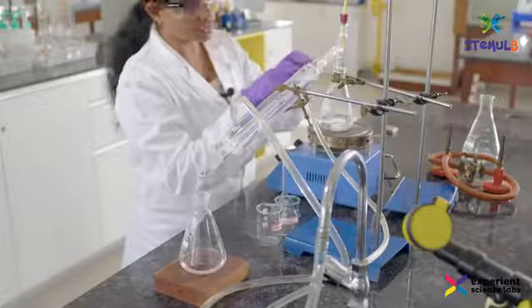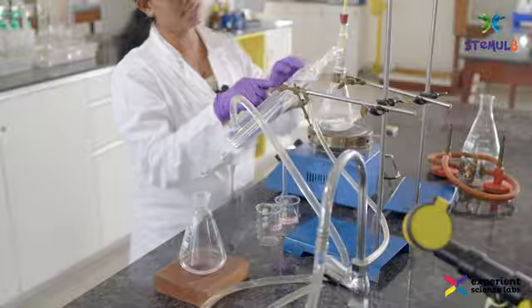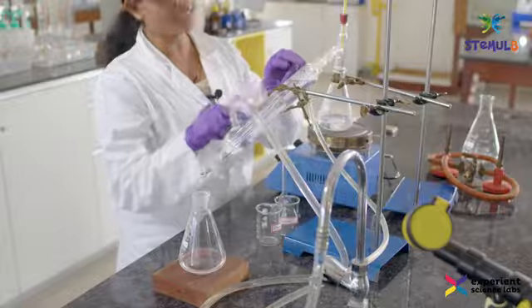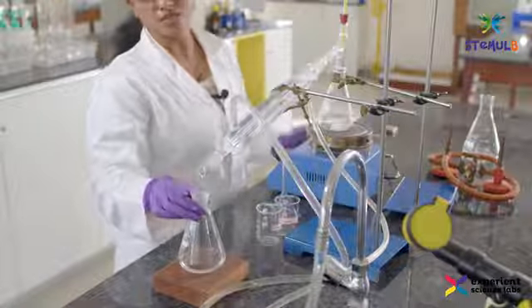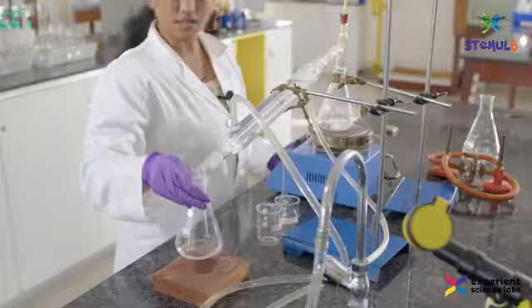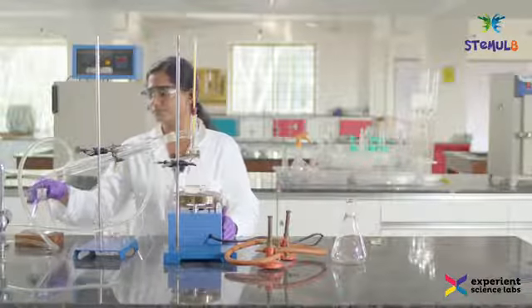You can also notice here that a few ethanol drops have been collected here, but the rest of the vapors pass through the condenser, and with the help of water circulation, these hot vapors get cooled, condense and are collected into the conical flask. So now we have separated ethanol from water, and you can all see this in the conical flask. However, we can also test whether what we have collected is ethanol or not.